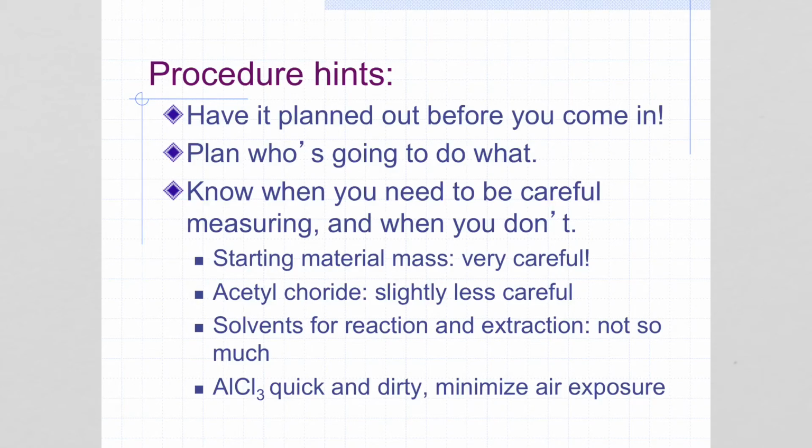Okay, before I take you through the procedure, just some hints to make sure that you are able to do this process efficiently. First off, really take some time to read the handout so that you have everything you're going to do planned out before you come in. It can be very helpful to talk with your lab partner and plan who's going to do the setup, who's going to weigh things out, all that kind of stuff.